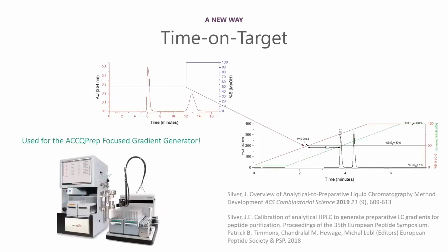The other methods are very complex. The linear solvent model works best with multiple scouting runs for each purification. The zones need the limits for each zone to be determined and tested. The accelerated retention windows algorithm needs the analytical dwell and column volume to be determined, and then a delta for the scouting run. A different scouting run needs a new delta.